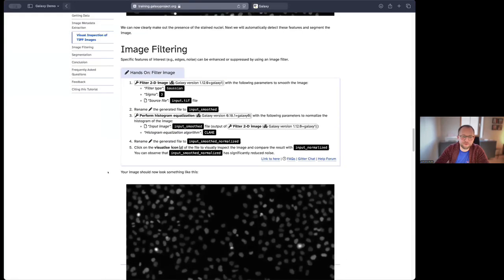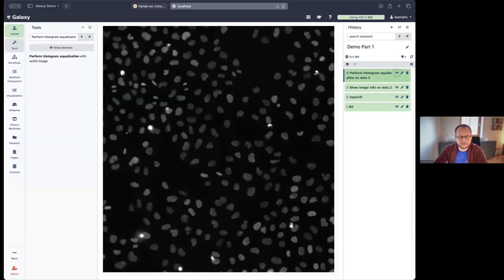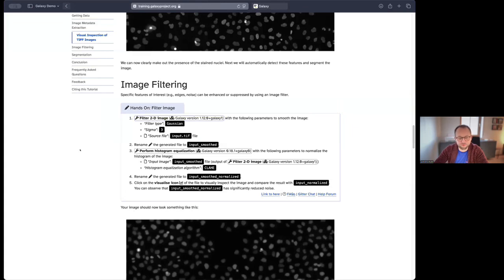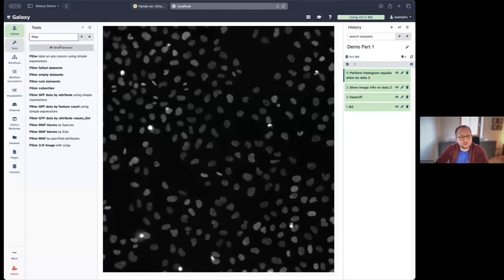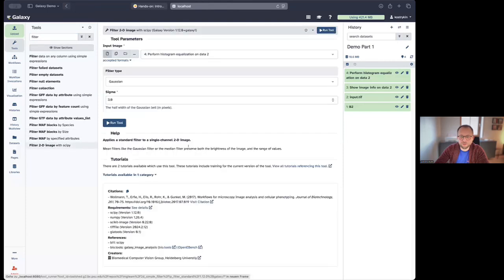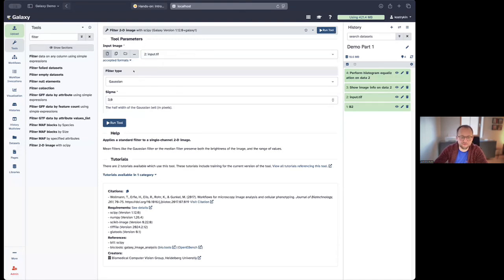Okay. So when it comes to the analysis, remember, we want to do image segmentation. First, we want to do some pre-processing. And by pre-processing, I mean we want to do some very rough noise suppression. And this is most easily done using a filtering tool, for which we use the filter image tool. This is wrapped around SciPy. We choose the original input image as the input image of the tool, because we want to have as much information in the image available as possible, so the full 16 bits, and leave everything else on default.